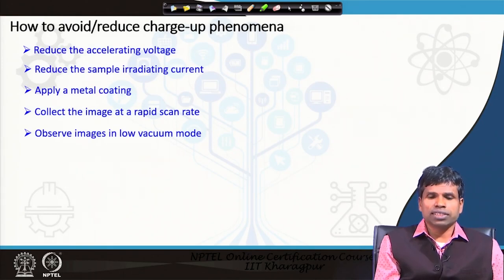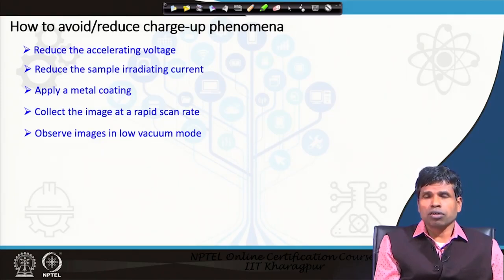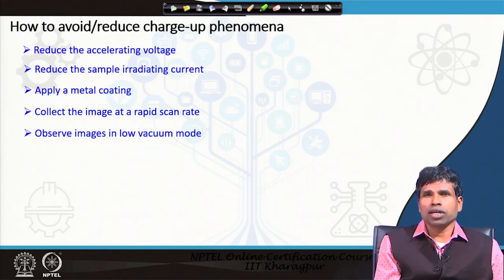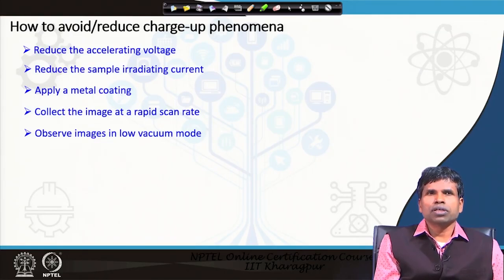How to avoid and reduce the charge-up phenomenon? There are different ways. One is to reduce the acceleration voltage — with higher acceleration voltage, more electrons strike the surface and more charge accumulates. Reducing the sample irradiation current is also related: higher acceleration voltage means more irradiation current and more charge build-up. Applying a metal coating means accumulated electrons will not stay at the surface — they will transfer to ground.